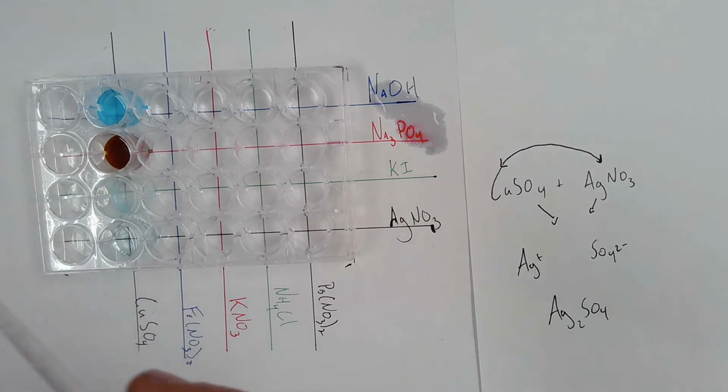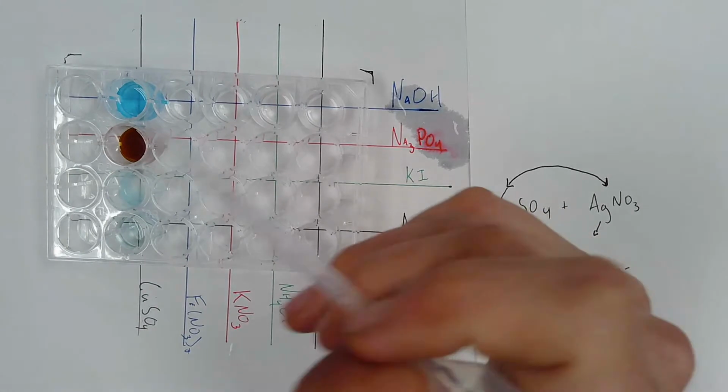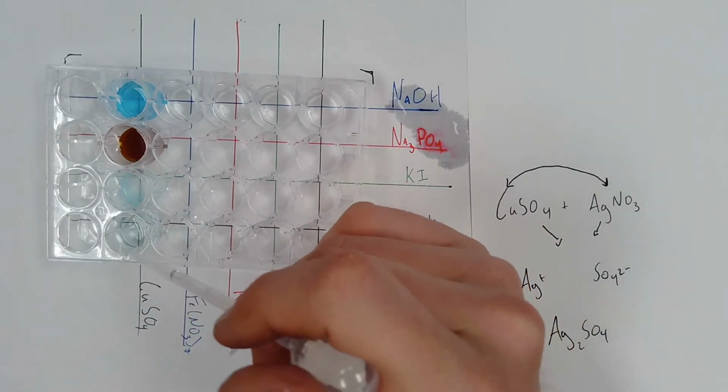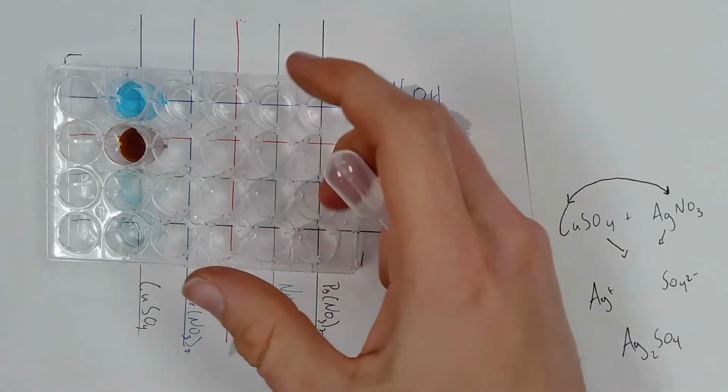And I don't see much happening. So this one isn't as obvious. Let's grab a test tube really quickly and spin it, but I want to point out that this is why we do labs.